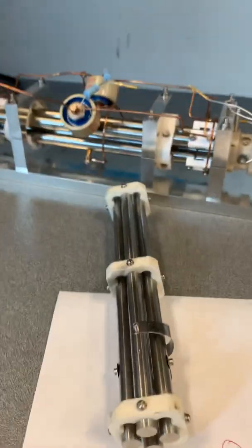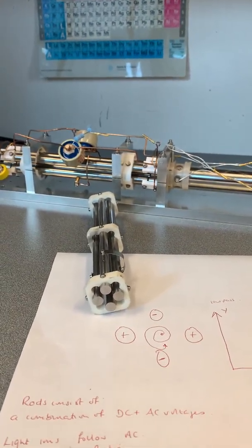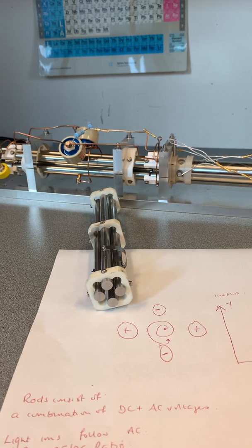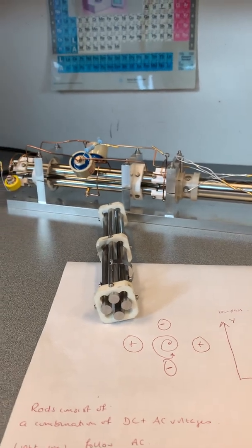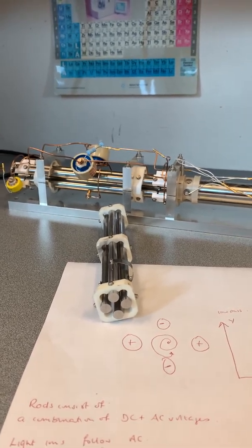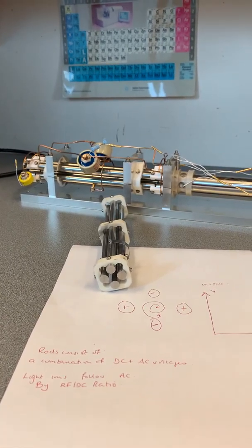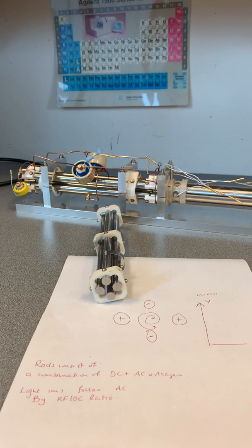So what are the quadrupoles? They are highly machined rods constructed in a particular way, held in place with precise positioning. They have an alternating current and a DC voltage put across them — the alternating current creates an RF, and depending on the combination of RF and DC ratio, it determines what mass-to-charge ions will be stable at any one point as ions transition down the quadrupoles. By scanning different RF and DC voltages, different ions will pass through to the detector, allowing us to scan from low masses to high masses.